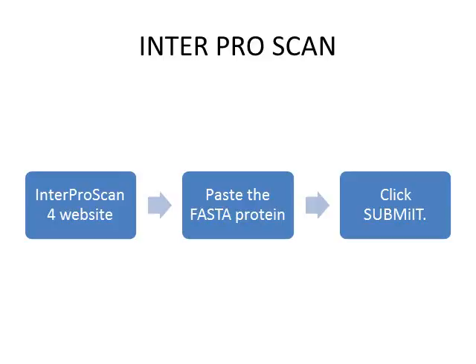Signatures are predictive models, provided by several different member databases that make up the InterPro consortium. InterProScan is a tool that combines different protein signature recognition methods native to the InterPro member databases into one resource, with lookup of corresponding InterPro and GO annotation.